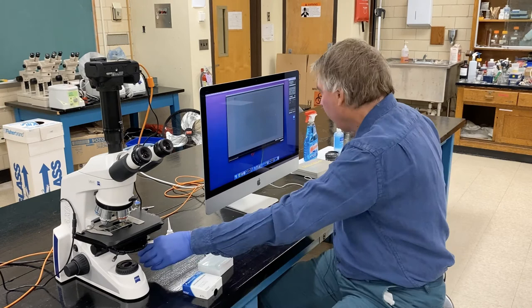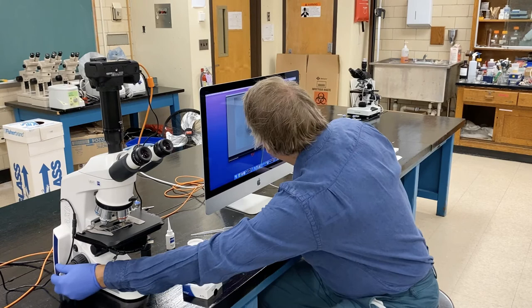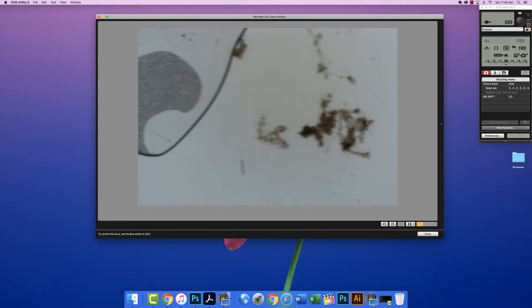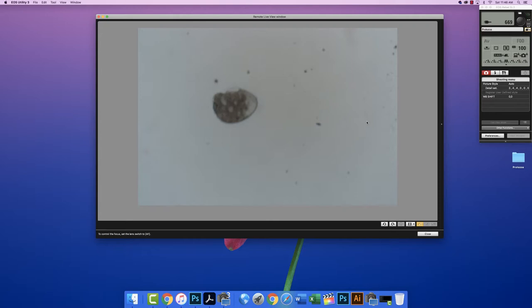Looks like there's something on here. So I'm gonna just find some material that I can focus on, and then I'm gonna focus with the coarse focus first, and then with the fine focus. And this looks like it's just food to me. We'll roam around and see if we can see any Stentor on here. That looks like an air bubble. But here we go, Stentor.